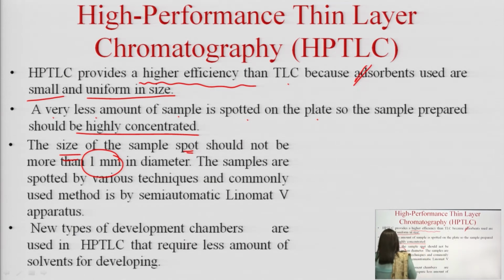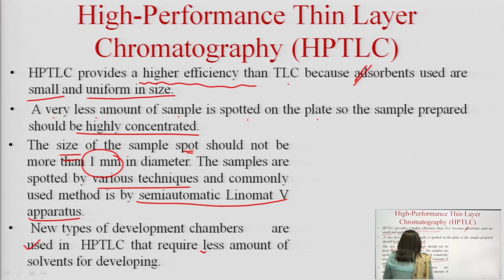The samples are spotted by various techniques and commonly used methods like semi-automatic Linomat 5 apparatus. New types of developmental chambers are being utilized in HPTLC that require lesser amount of solvent for the development of the chromatogram. So, let us have a look.